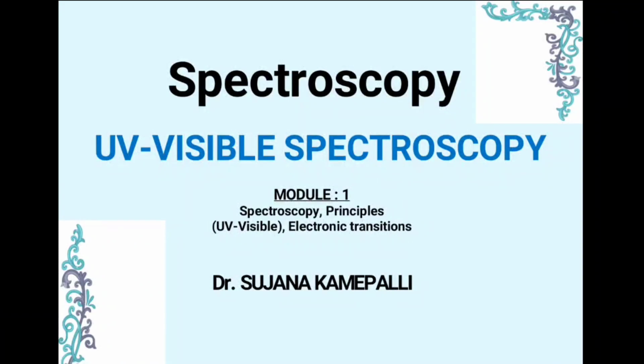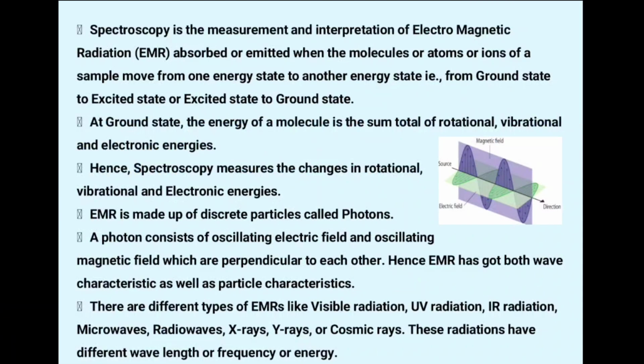Good day. Today we are learning about spectroscopy. In spectroscopy, you are getting knowledge on what is spectroscopy, what are the principles involved in UV and visible spectroscopy, and what are the different types of electronic transition. Let us see what is spectroscopy.